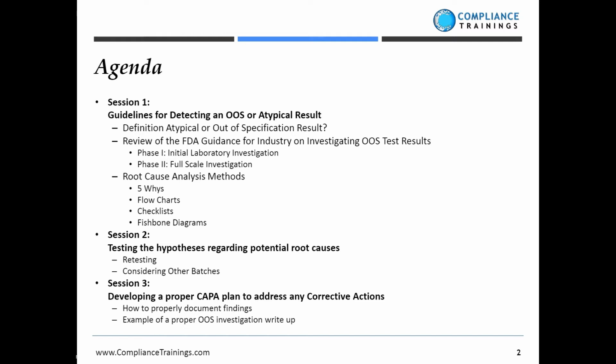The biggest mistake or biggest blunder we can make in these types of investigations is to get to the root cause and write a very short sentence stating no root cause can be determined at this time. We never want to do that. We want to make sure that the auditors, the investigators, the third-party individuals that are reviewing our investigations actually can see the work that we put forward into doing that.